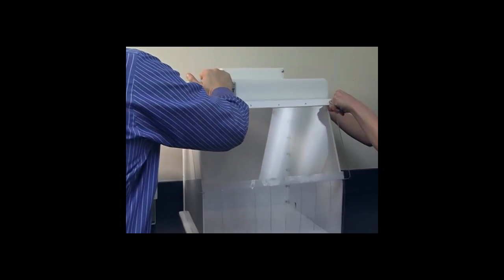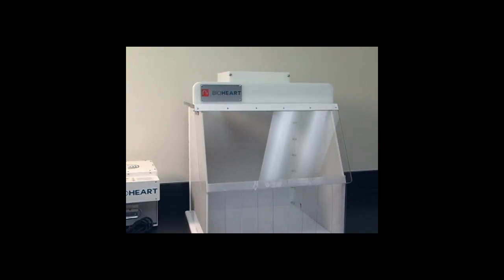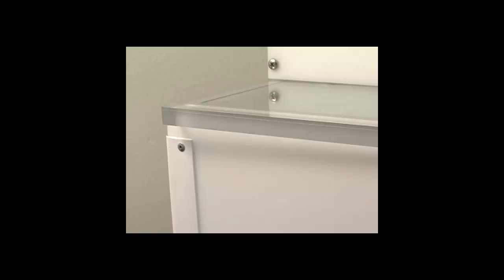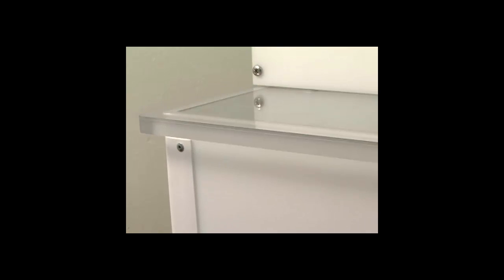After you have completed screwing in the support bar and filter box, pick up the top and front panel of the hood and place on the side panels. It is best done using two people. Please note, this piece needs to be seated properly into the side and back panels.